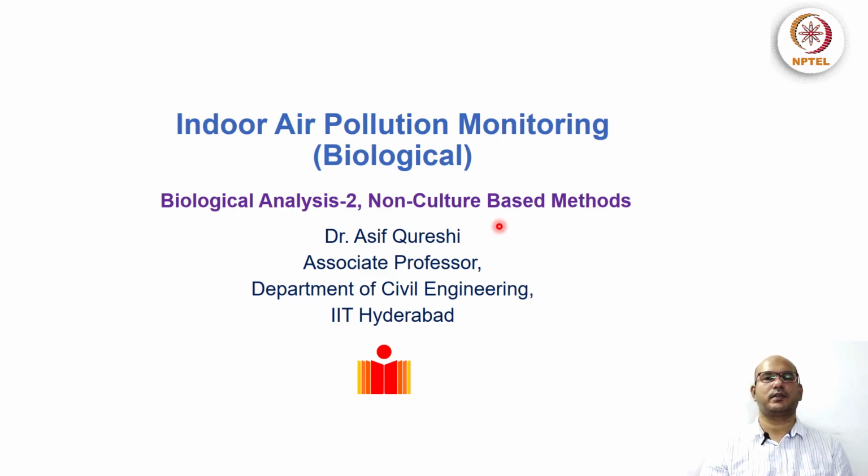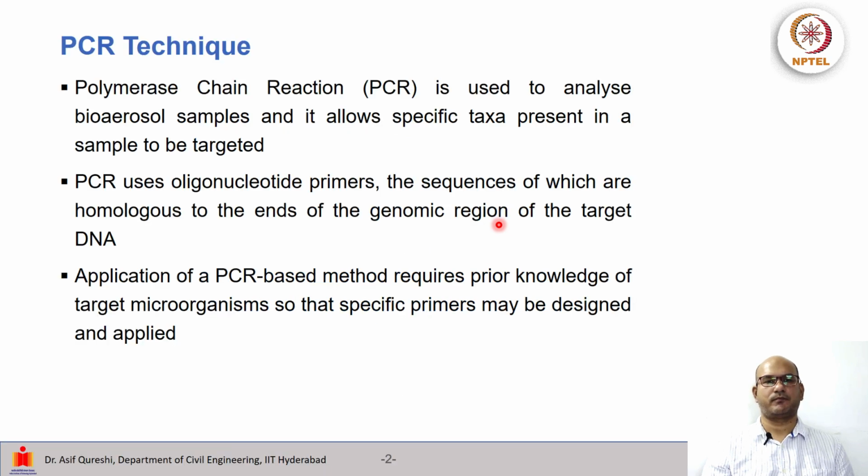Hello friends, so in this lecture we will cover the biological analysis by non-culture based methods. First is the PCR technique, which is essentially the polymerase chain reaction. It is used to analyze bioaerosol samples, and it allows specific taxa present in a sample to be targeted.